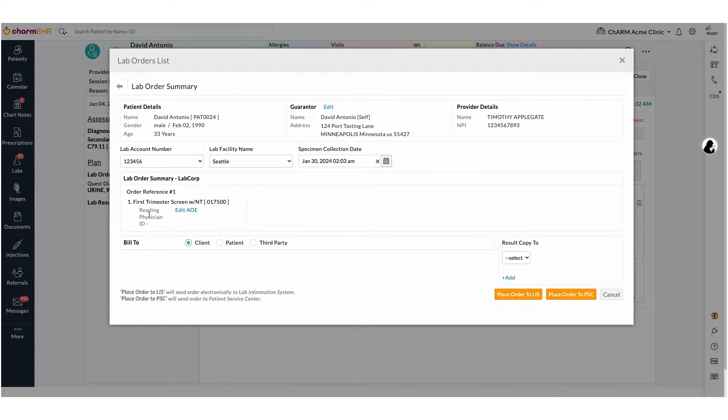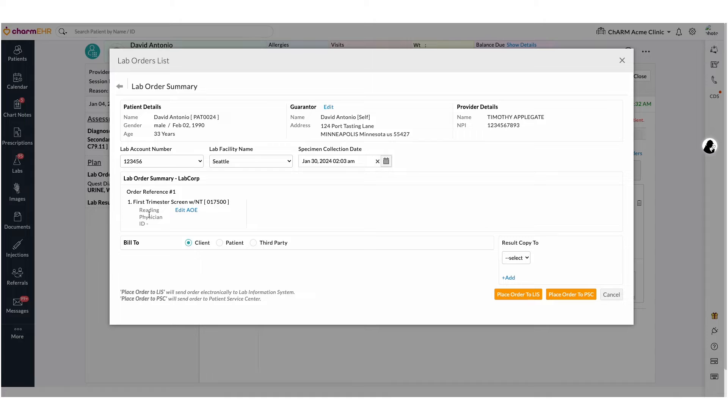You can view AOE information below and can make any necessary edits here. Labs can be billed in three ways, such as client, patient, and third party. You can select the option based on the individual who pays the lab fee.